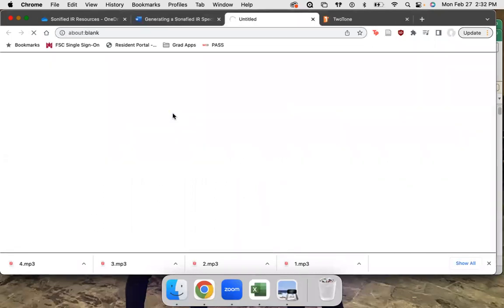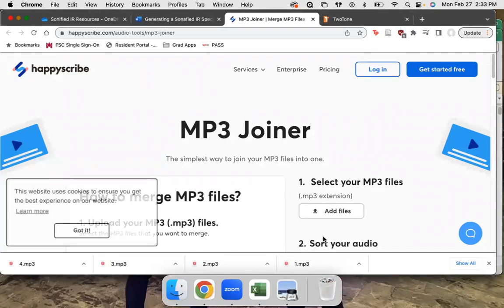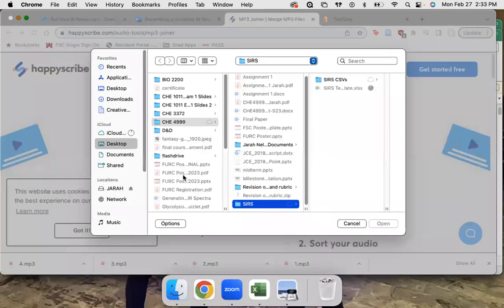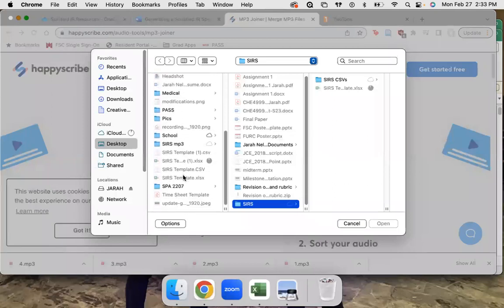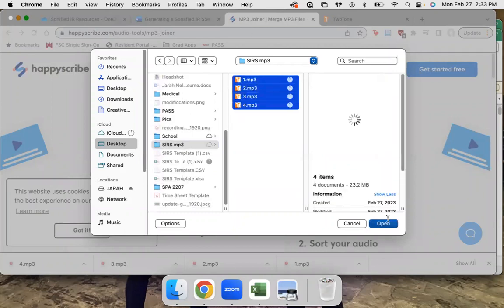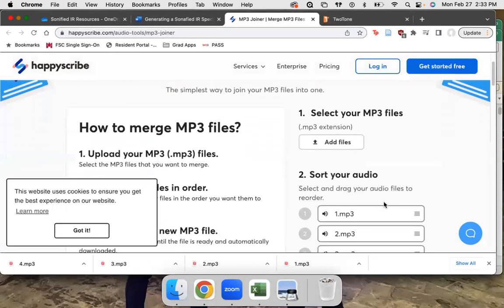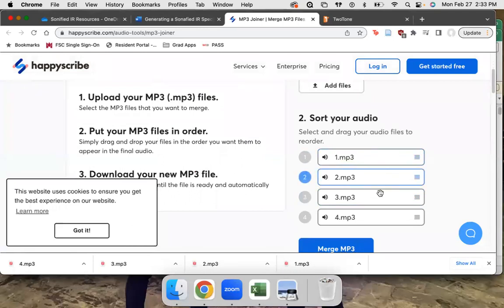So we're going to go to this website now. We're going to add our files. Put them in order.